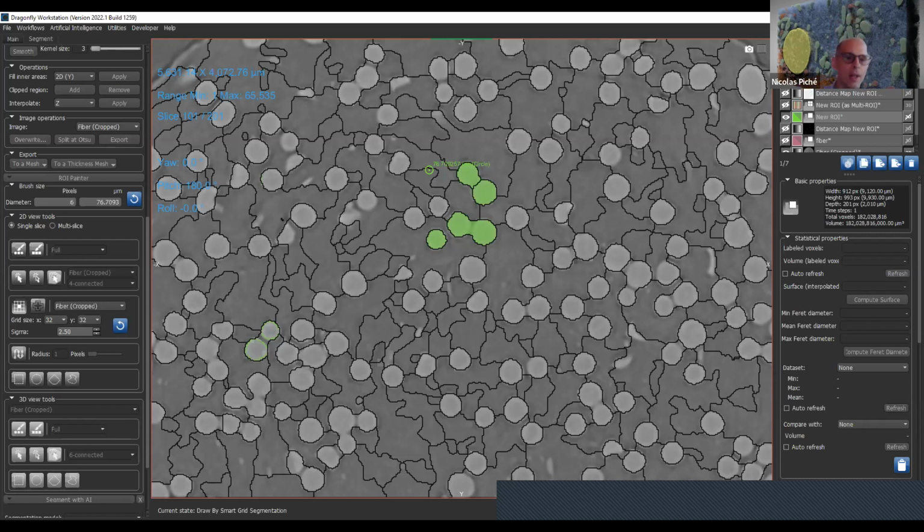Thank you very much. There's a question about whether you can export each class in a multi-ROI as different meshes. Well, you can have a mesh that has the scalar value of all the labels. But like I said, multi-ROI can have up to 4 billion, and you don't want to have 4 billion of the same object. But it's possible to extract all the classes of a multi-ROI as multiple ROIs, and you can multi-select them and generate a mesh of it. It's quite easy.